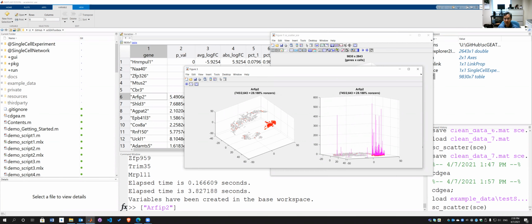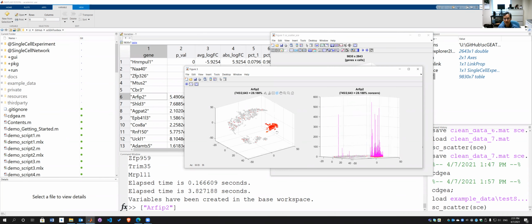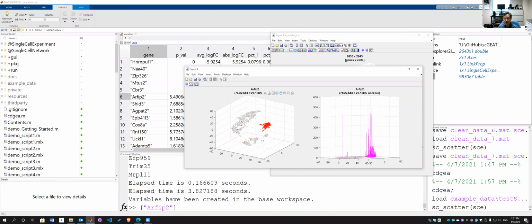This differential expression analysis is slightly different from the network analysis, but you certainly can combine the information you learned from this exercise and try to figure out the possible underlying principle of these gene activities.